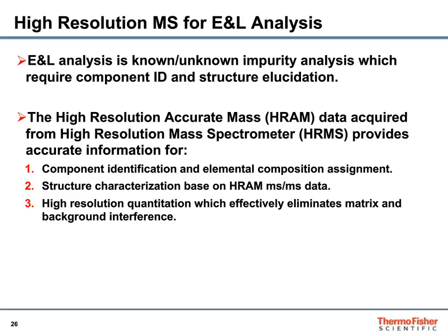The high resolution accurate mass acquired from the high resolution mass spec provides accurate information for component identification, the elemental composition assignment, and structure characterization based on the high resolution accurate mass MS data.